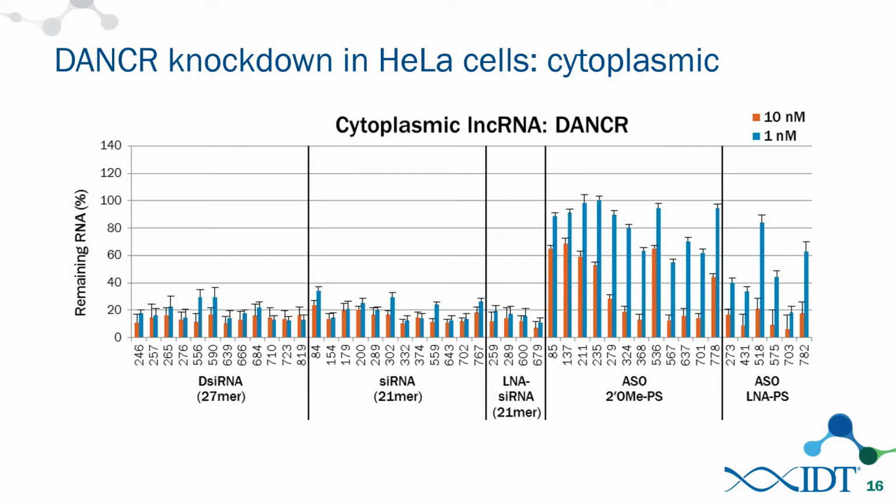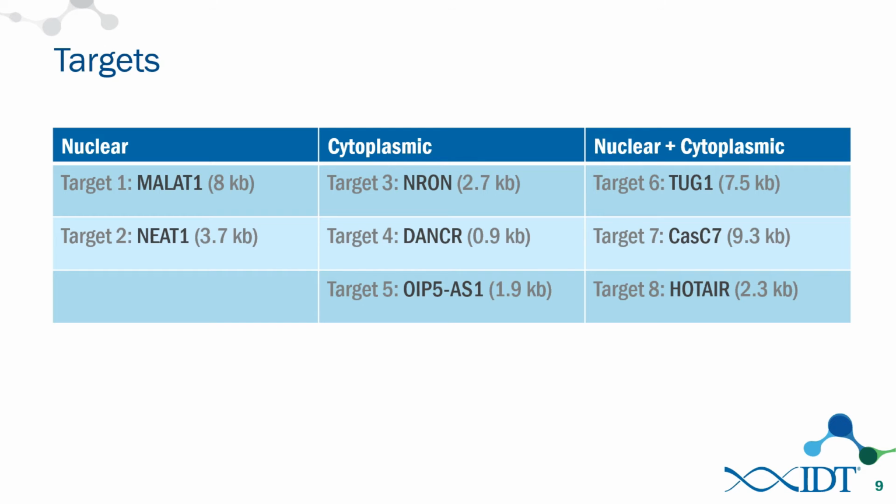Cool. Another thing is that you earlier on were discussing what your lncRNA targets were, and you were mentioning the lengths of them. Is there any significance to the length of the target? Well, there can be. For messenger RNA, when you cleave it, it makes a non-functional protein, and so having retained fragments isn't as detrimental to your experiment. These long non-coding RNAs, however, a lot of them have structural significance in the cell as far as their function is concerned, and these structural components can bind proteins or can potentially be difficult for them to be degraded naturally after they're cleaved by RNases in the cell.